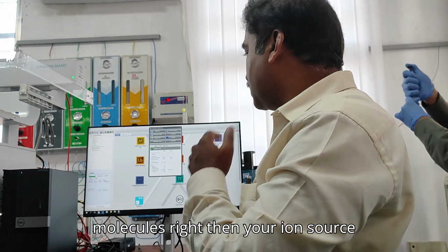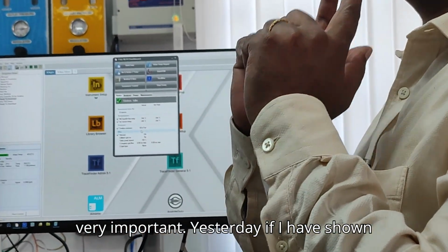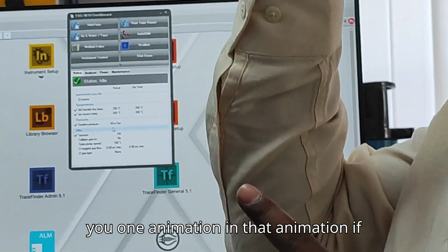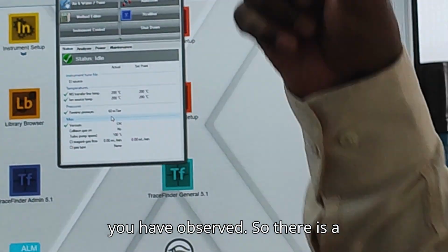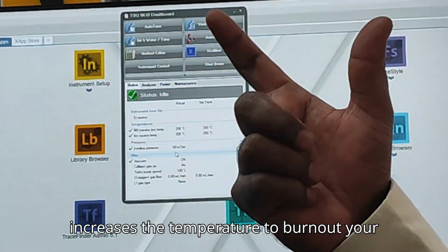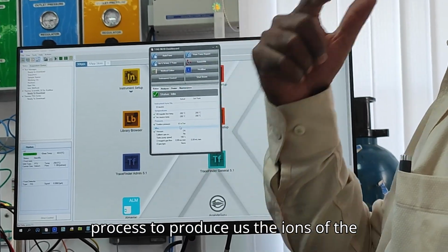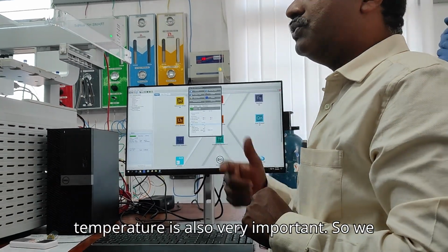Then your ion source temperature. Ion source temperature is very important. Yesterday I showed you one animation, and if you observed, there is a temperature cell, coils, that increases the temperature to burn your molecules for the ionization process, to produce the ions. So the temperature is also very important.